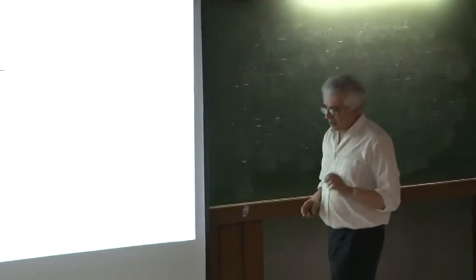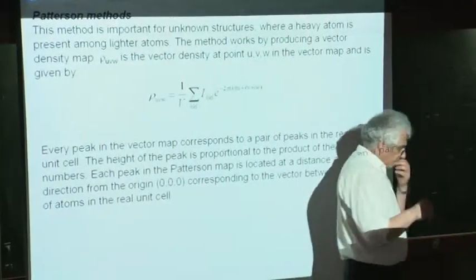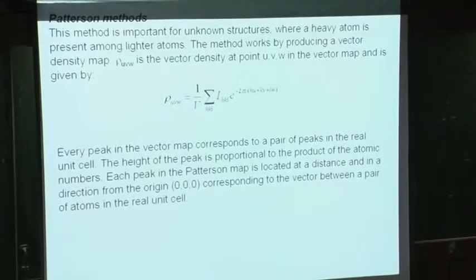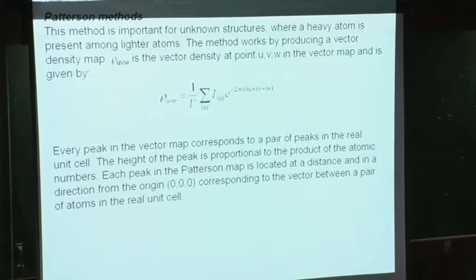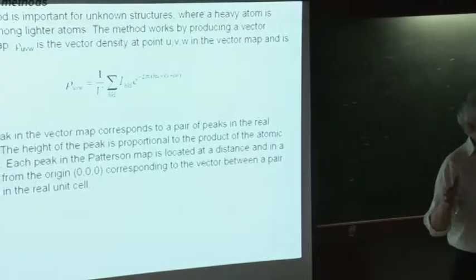So what is it? If you imagine, so the way that the Patterson method works is you produce a vector density map. That's what you're doing.